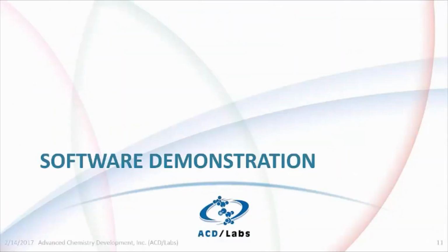So now I would like to turn things over to my colleague Anne-Marie, who's actually going to go through the software and demonstrate to you how you can optimize different method parameters within the ACDLabs platform. Thanks, Brent.